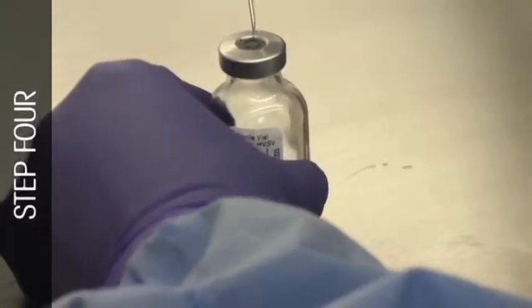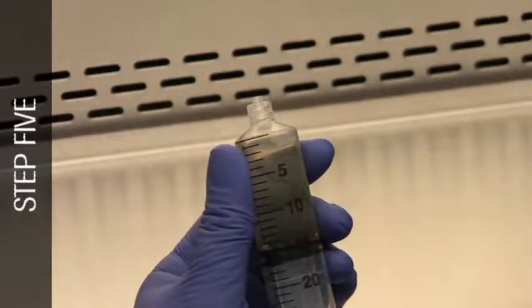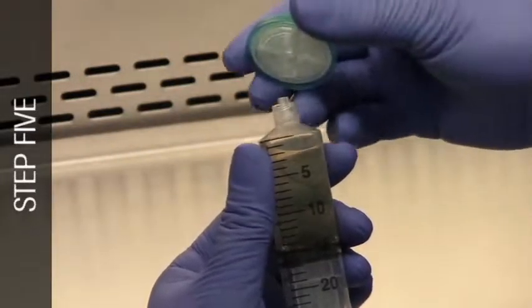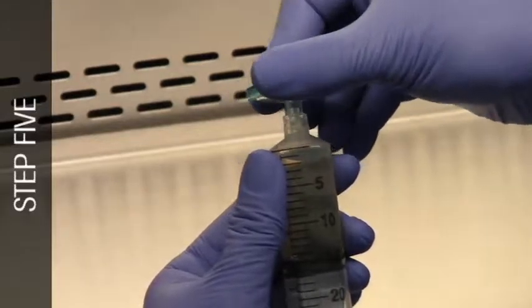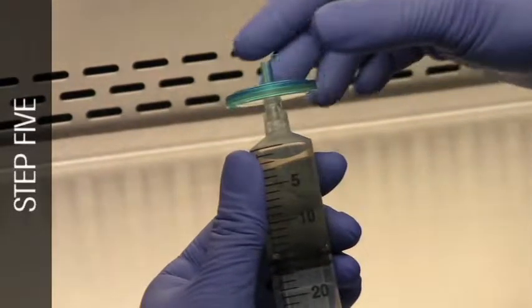Transfer 5 ml of the broth to the vial labeled Control-1. Remove the needle from the syringe and, using aseptic technique, affix a sterile 0.2 micron porosity filter unit and a 20 gauge needle to the syringe.